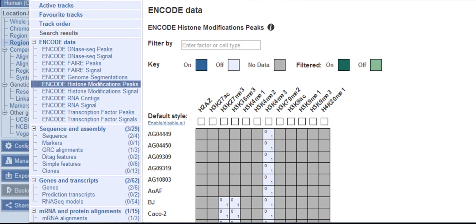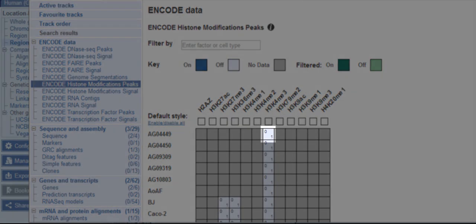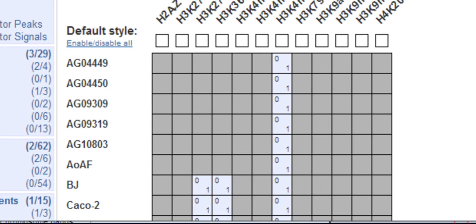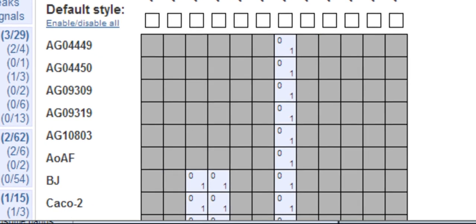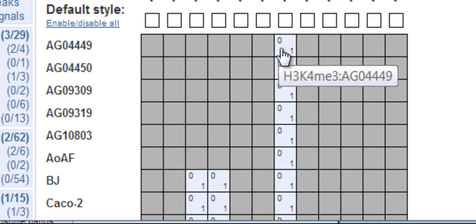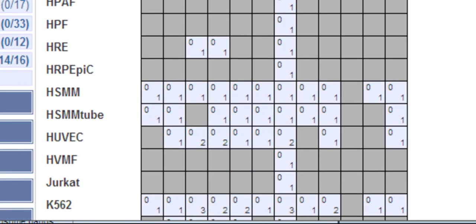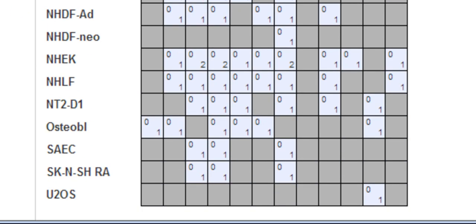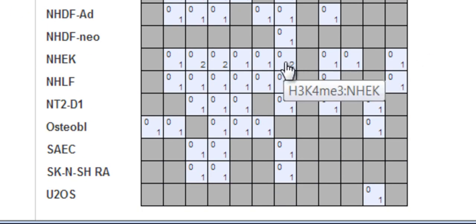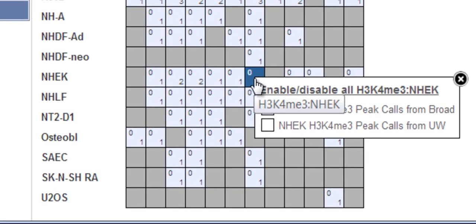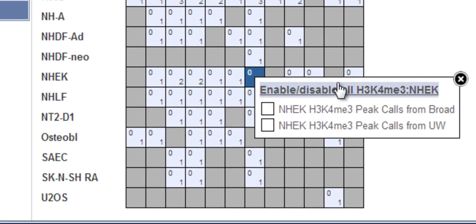You will see two numbers in a cell like this one. It shows how many pieces of data are in the cell and how many are displayed at the moment. For example, 0 out of 1 for this cell type is shown. And you do have cases where there are two different possible experiments. You can click on that to find out what the two are.